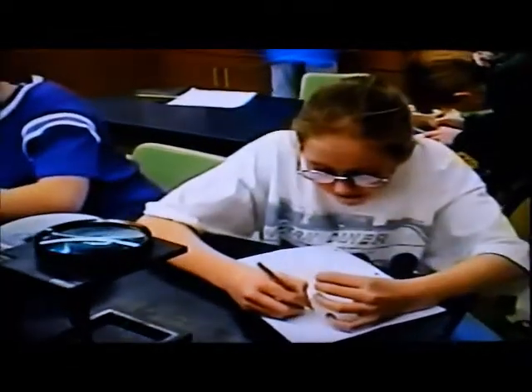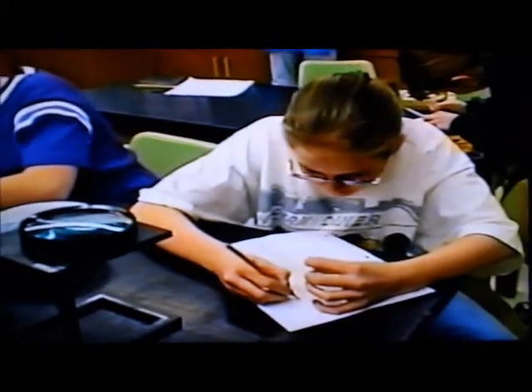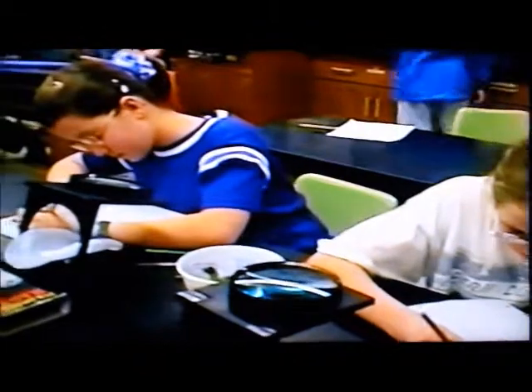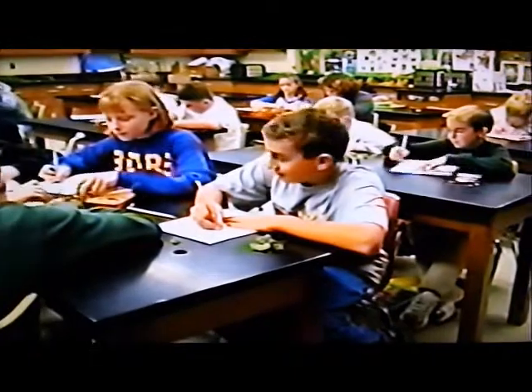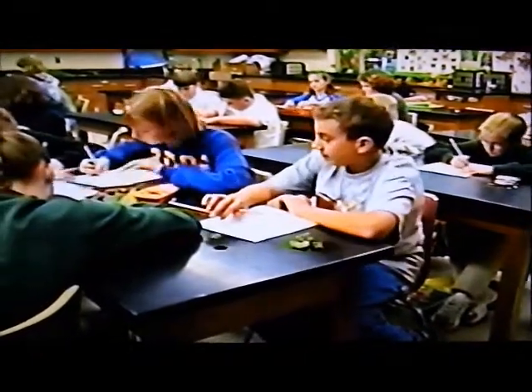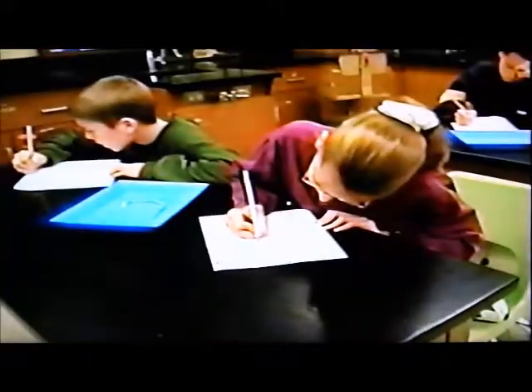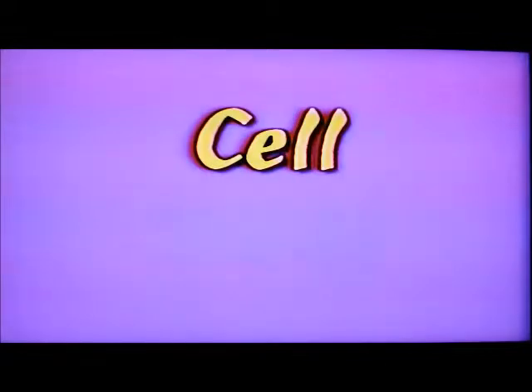Afterwards, in all of our laboratory investigations, students record their observations after carefully observing the specimens with either microscopes or large magnifying lenses. They use pencils to outline and record details, and then colored pencils to create a lifelike appearance. You will see students working together in groups of 2 or more. However, each is responsible for his or her own accurately drawn and neatly labeled work, which will become part of the individual science portfolio.